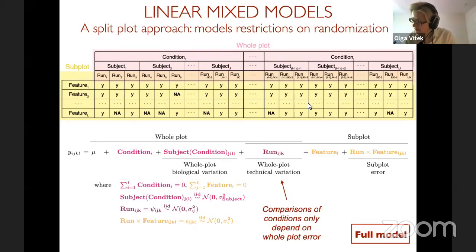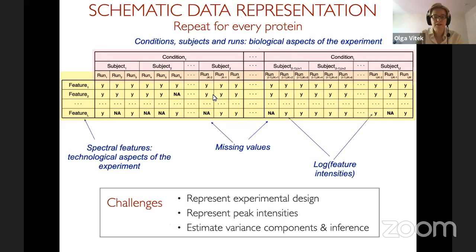Okay. Is it common to use pooled data as quality control? Sure. But again, this is something that does not fit into this current discussion. But usually as QC samples that you interleave between the endogenous samples, this is really good practice. So I invite you to look into MSstatsQC, and we have a series of publications associated with that where we discuss these topics.